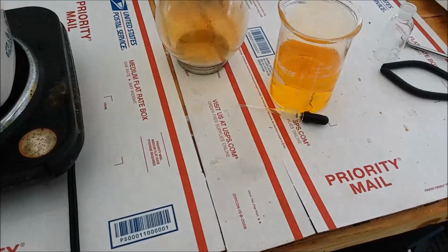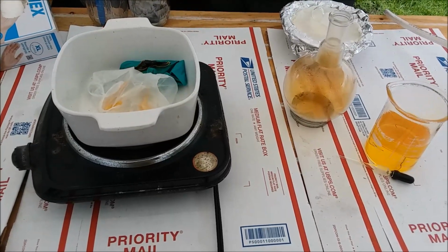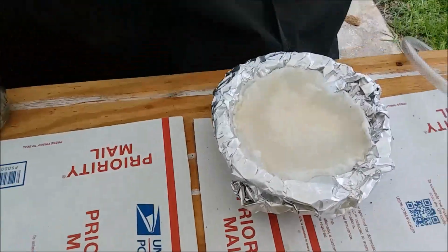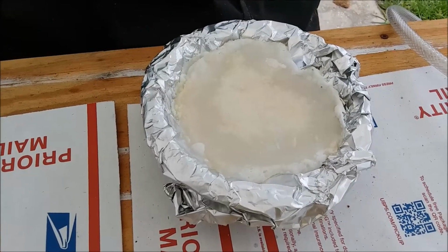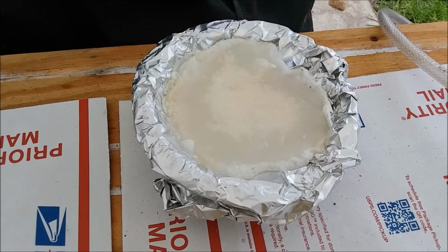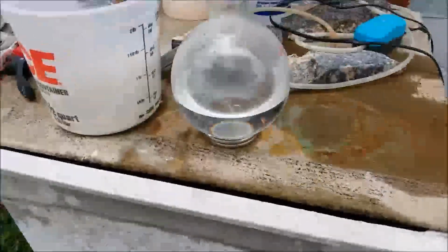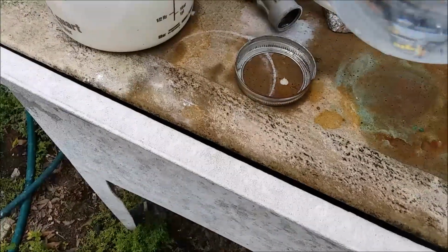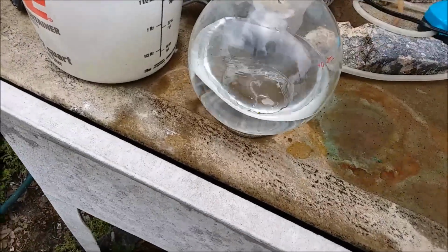And I've got a lot of nitric acid. The distillations went without pain. I've got a new way of cleaning the glassware by dumping the semi-liquid sodium bisulfate product out before it hardens in the boiling flasks, and then the boiling flasks clean up real quick. Here's the 1 liter flask. It's just a little tiny bit. Oh, actually it's dissolved. Okay, it's all gone. So cool. It's all gone.